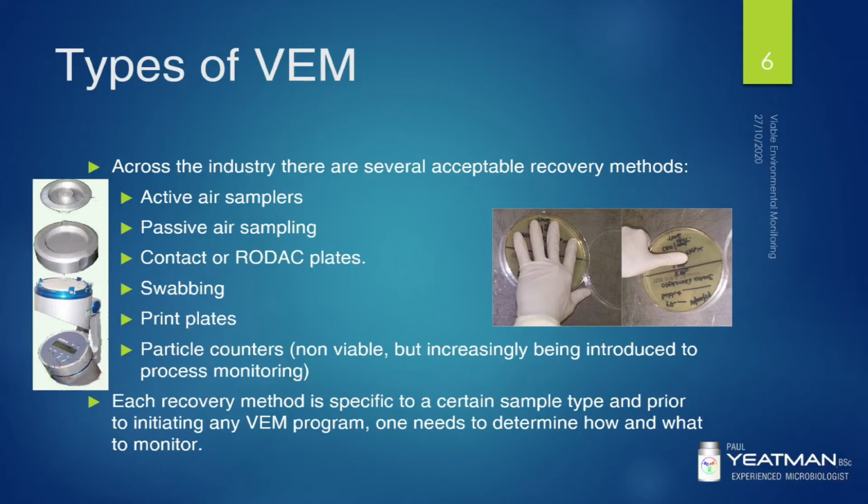For taking samples of the prints of a production operator, having them press their fingertips to the surface of an agar plate is better than sampling each fingertip with an individual contact plate. Less time, less materials, less actions, less chance of a mistake propagating into a problem.